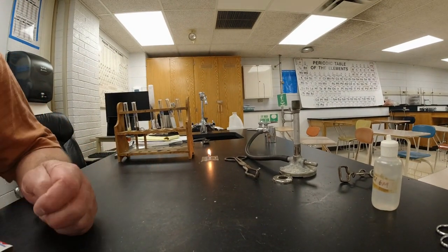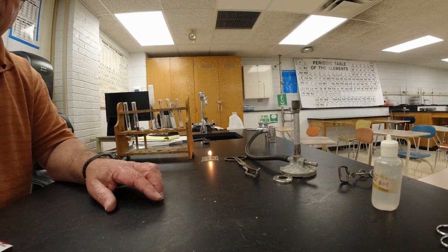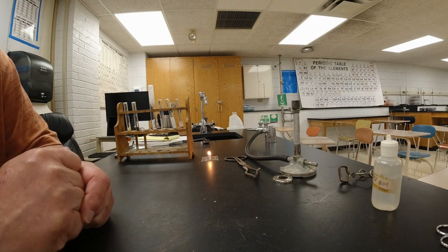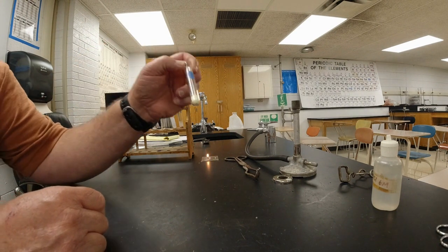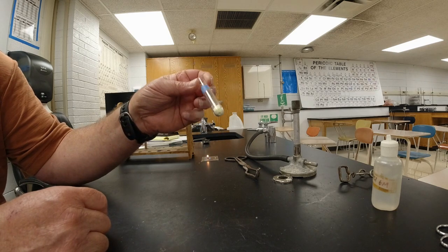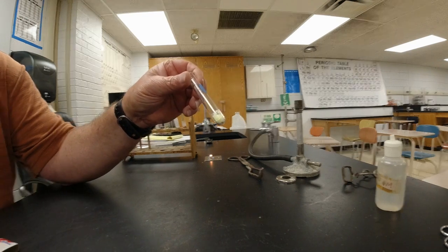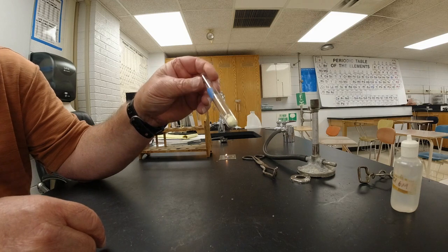Now, in the next step, in number 7, this is something that I would do for you as a demo. All right, I have sulfur. The chemical symbol for sulfur is S. It's a yellow solid. This has been ground up into a yellow powder, and it's got a sulfury smell to it if you were to do that. And the powder's kind of sticky. It seems to stick to stuff, right?